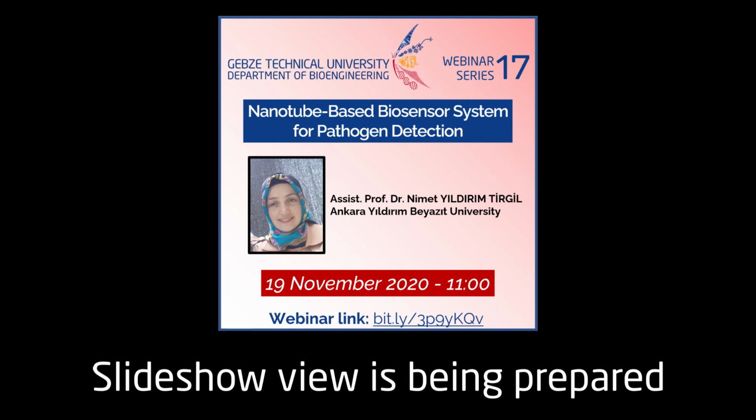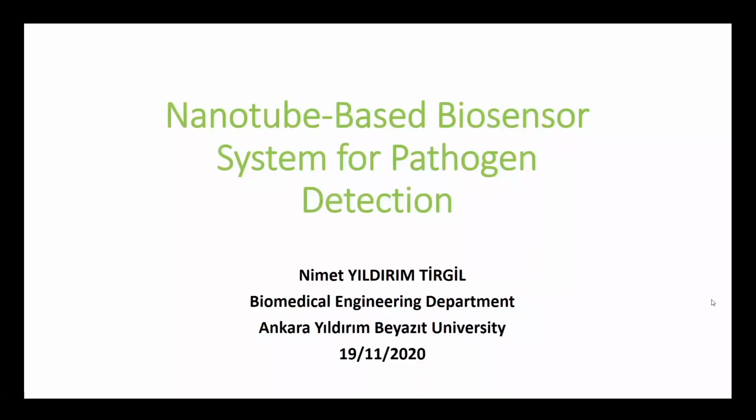So today, let's try to share first. Today I will try to talk about a part of my PhD work. It was actually a little old. It was from 2015, I guess. So I will talk about a part of my PhD work. It is nanotube-based biosensor system for pathogen detection.